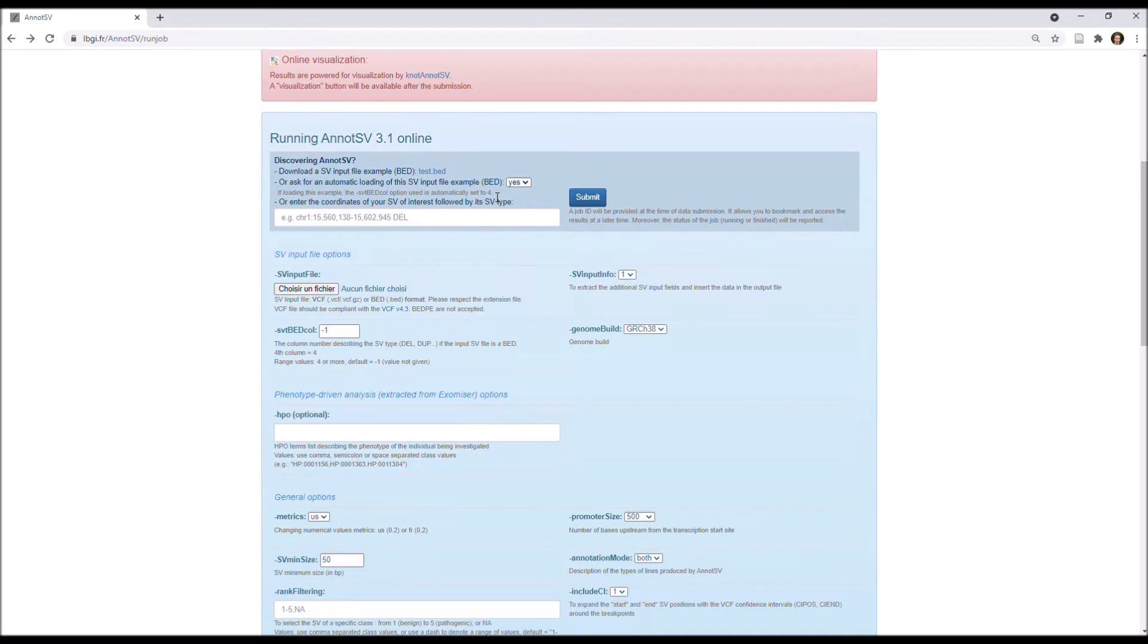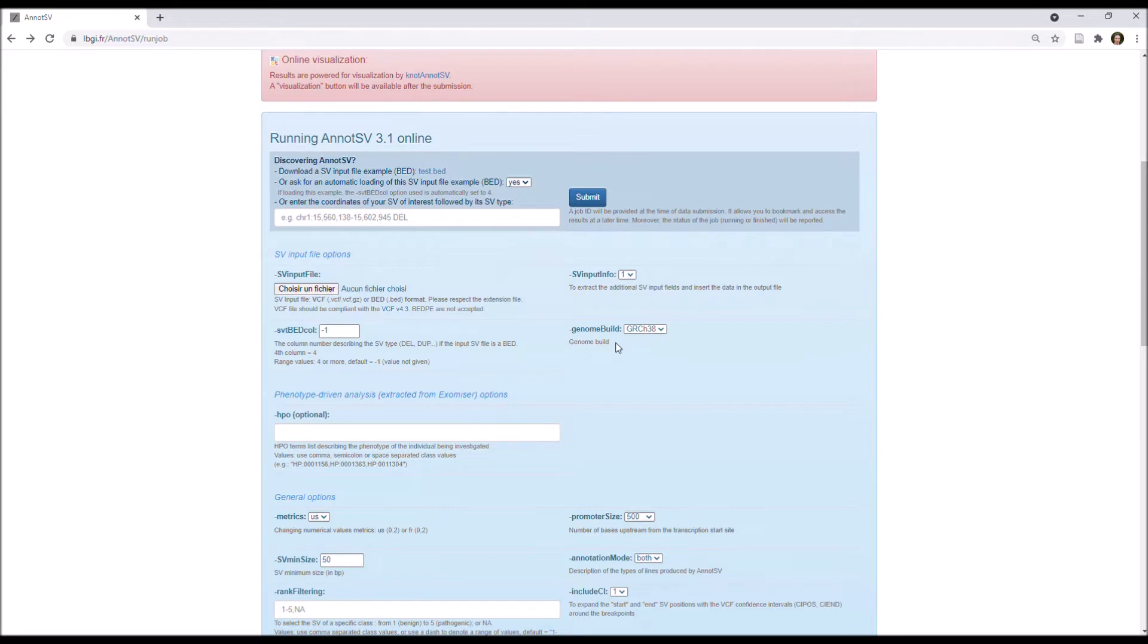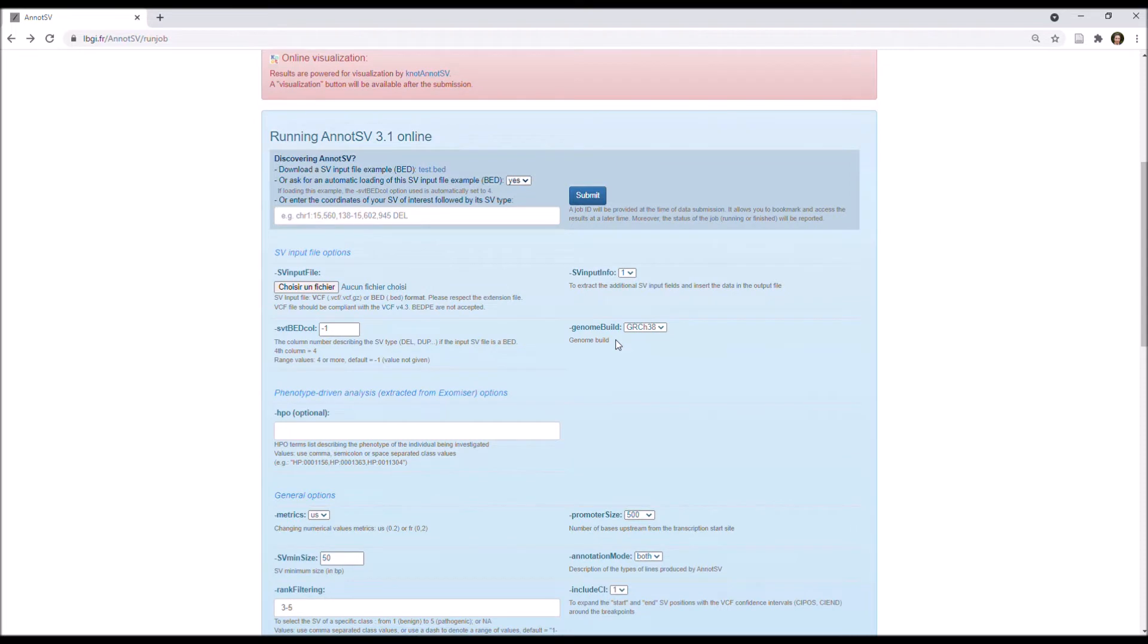As you can see, there are few parameters to run your job, and in my opinion, three options are really important to check. First, you need to take care about the genome build option, and to be sure to choose the one used to align your data.